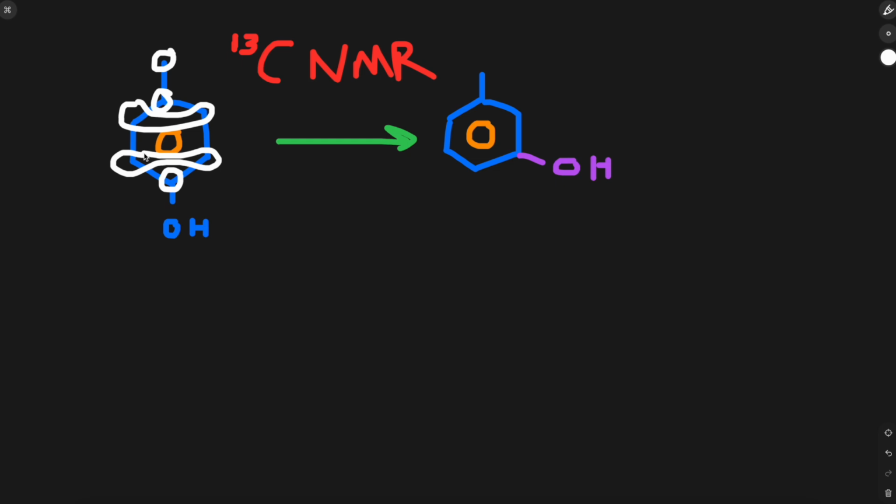Because if I took this molecule and I blindfolded you, and I spun this molecule around really fast, like when you're playing a yard game and you spin around the baseball a million times and you get all dizzy, imagine I did that with the molecule, and then I unblindfold you and I tell you which carbon was the one that was originally left. You would have about a 50-50 guess on which carbon is actually that carbon, right? Because they're not chiral, and because of that, they're chemically equivalent.